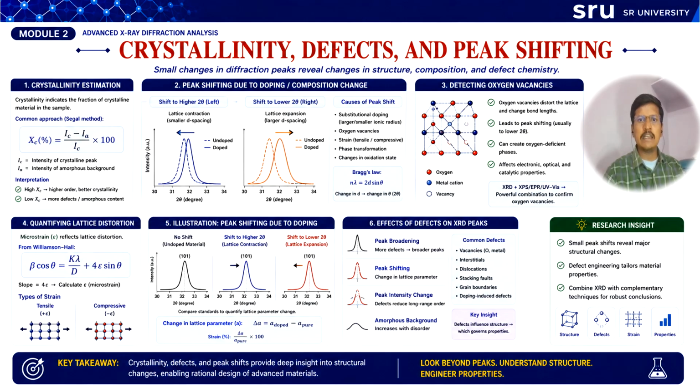So the crystallinity, defects, and peak shifting will help you understand how XRD can be used to analyze, and even very small changes in the diffraction peaks can provide extremely valuable information about the internal structural formation and the crystalline structure of the material.